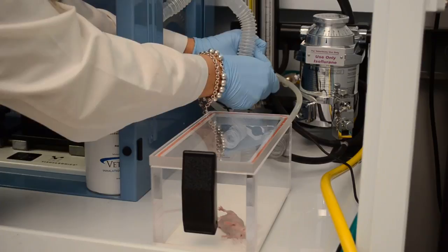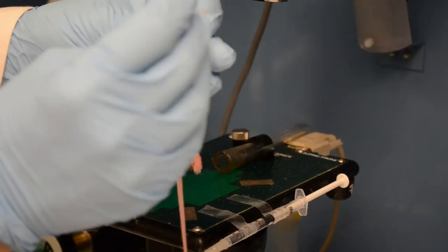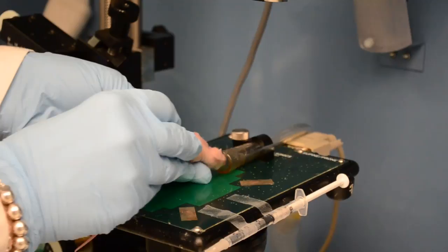Take the mouse out of the induction chamber and gently place eye lubricant to prevent dryness during imaging. Place the mouse on the imaging platform on its side to prepare for vascular access through the tail vein.